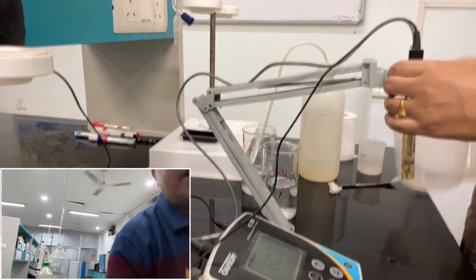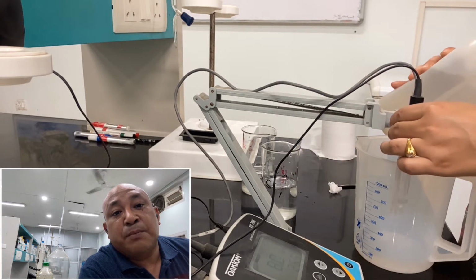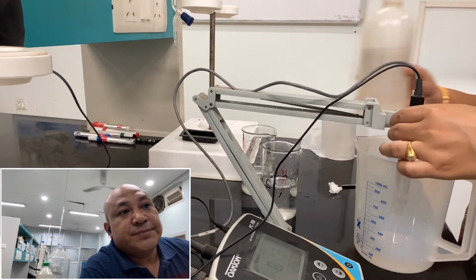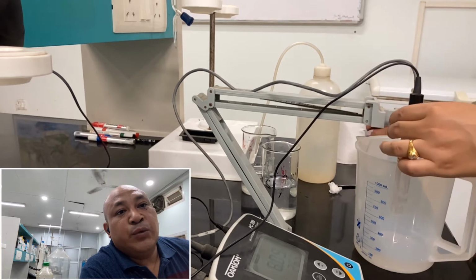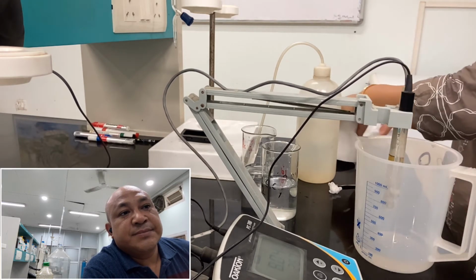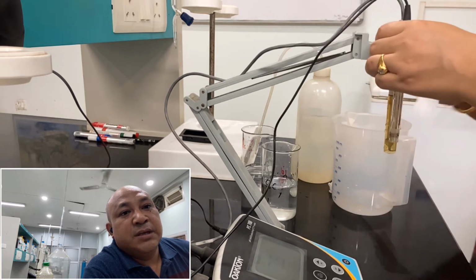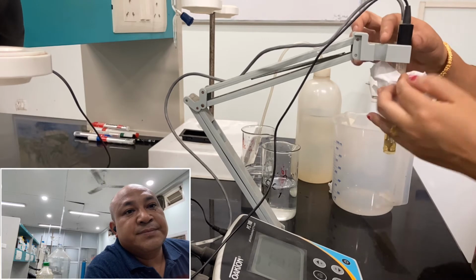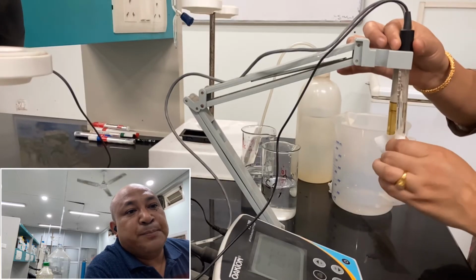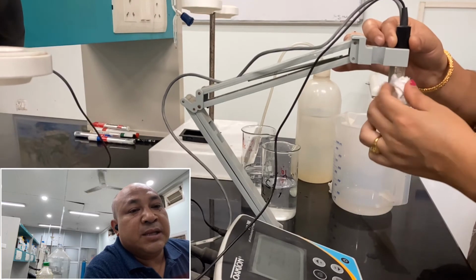For this, again, we have to wash with distilled water to remove all the contaminants of the previous samples. And then we have to rub with tissue paper again. We will keep the new sample, clean it properly, or rather wipe it properly, and then please put in a new sample.